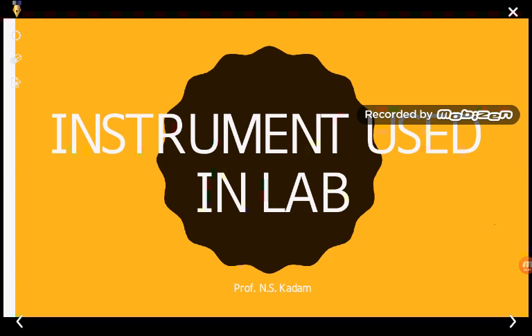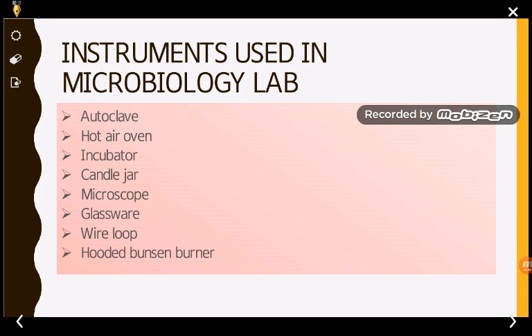So you know the equipment such as autoclave, hot air oven, incubator, candle jar, microscope, glassware, wire loop, and hooded Bunsen burner. These are the different equipment and resources which we normally require while performing microbiology related experiments.